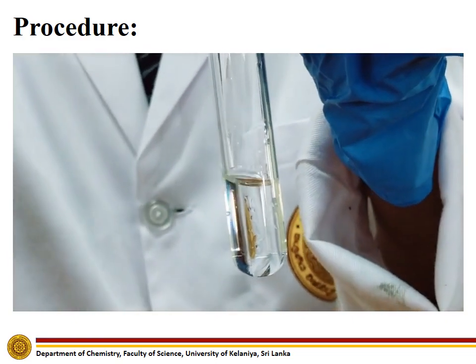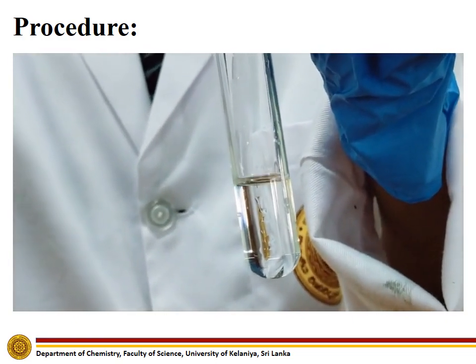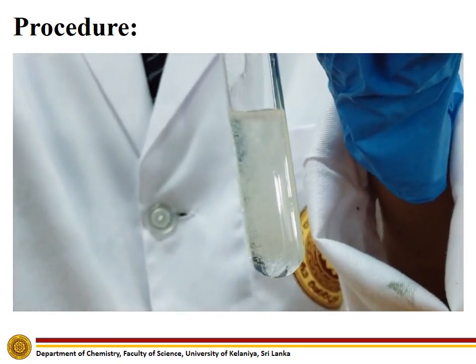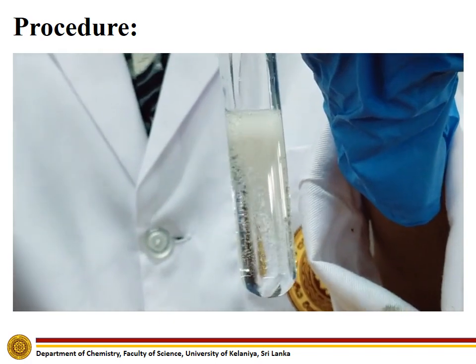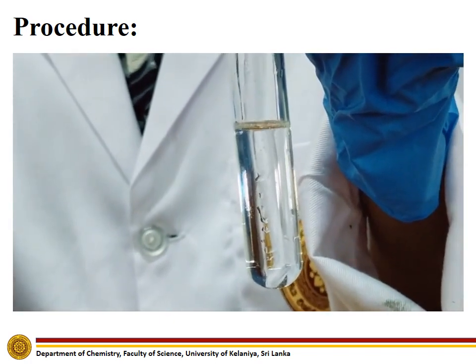When the carboxylic acid is added to a solution of sodium carbonate, evolution of gas bubbles was observed.